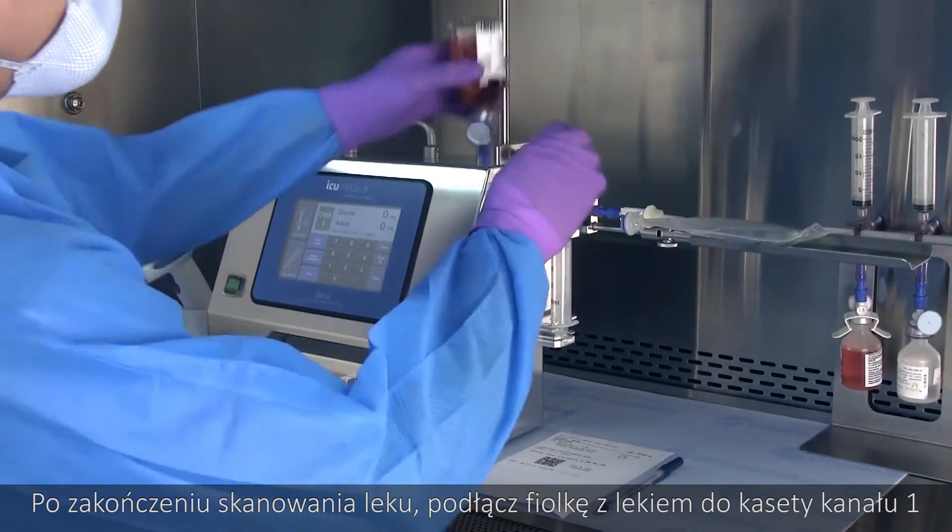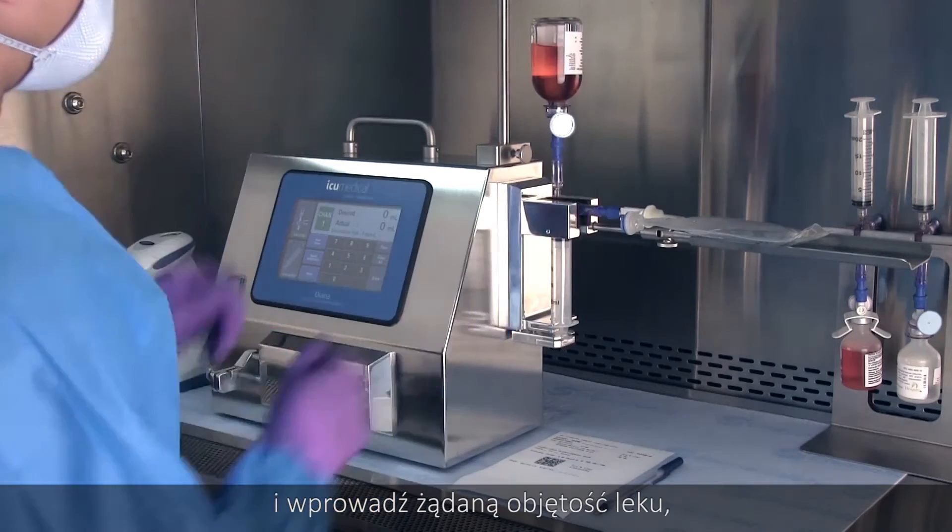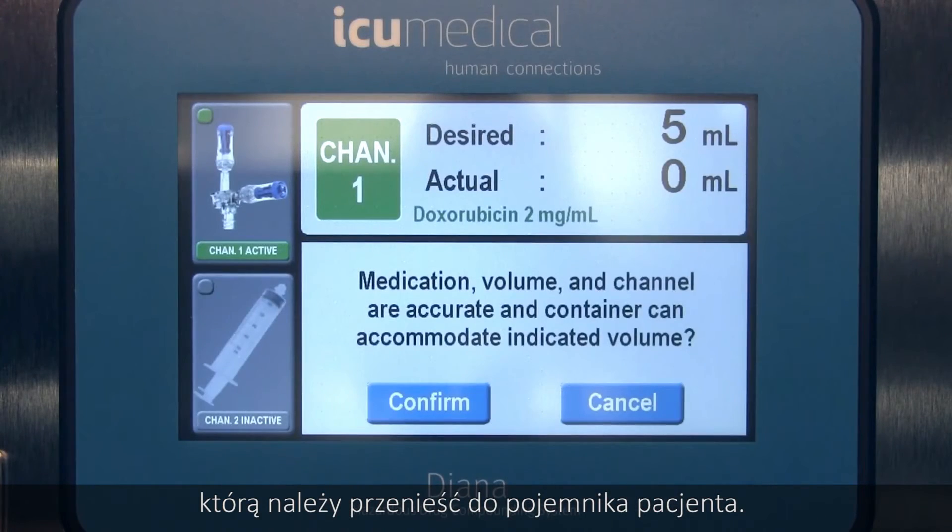When you're done scanning the medication, attach the drug vial to the channel 1 cassette and enter the desired volume of drug to transfer to the patient container.